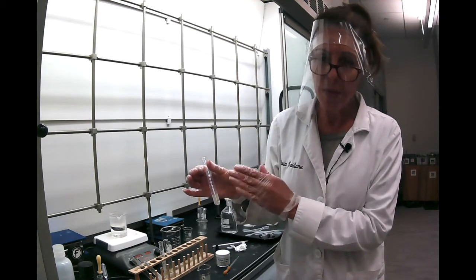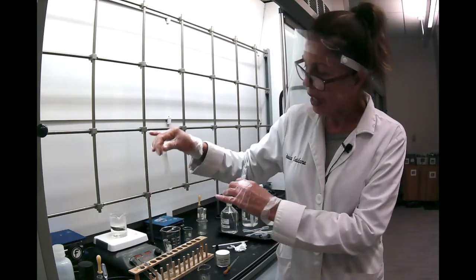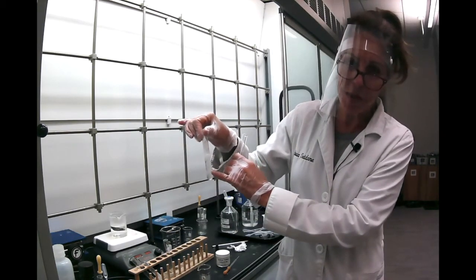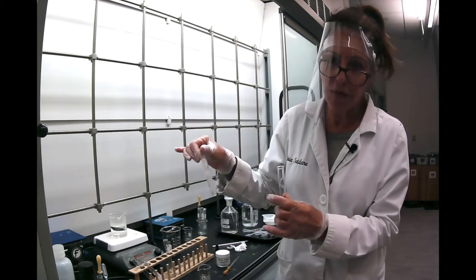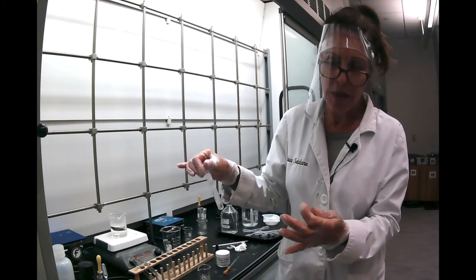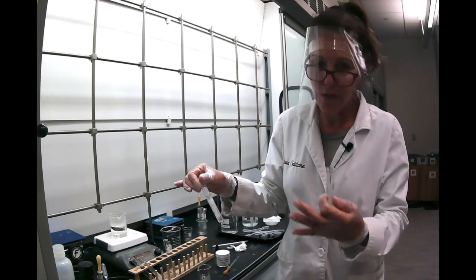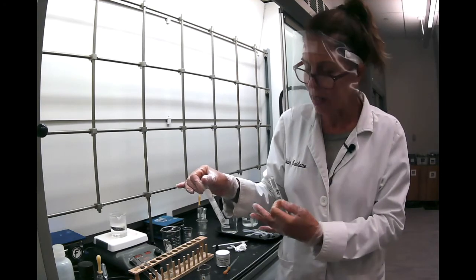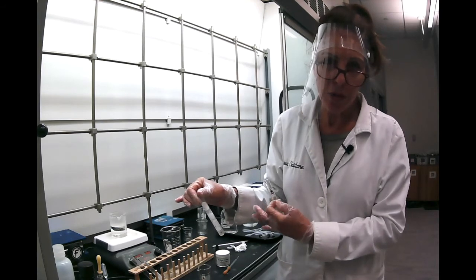So most of the benzoic acid was in the aqueous layer, and that's what you see here. That's the precipitate that we formed. So the active extraction works a lot better because it works chemically. So all the benzoic acid will be forced to leave the methylene chloride layer and go to the water.